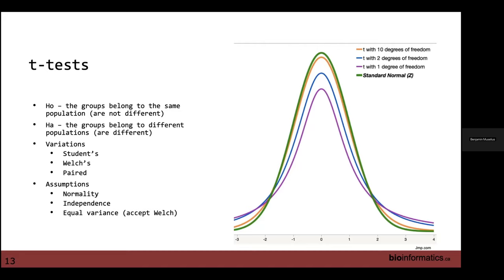And on the right, again, the t-test uses a specific t-distribution. There's a couple different ones overlaid there. What governs it is the degrees of freedom. I guess this is a good opportunity to mention, degrees of freedom is directly related to the number of replicates we have in a test. And I think it goes without saying, the more replicates we have, the better data we're going to have, the more sure we are of our observations.